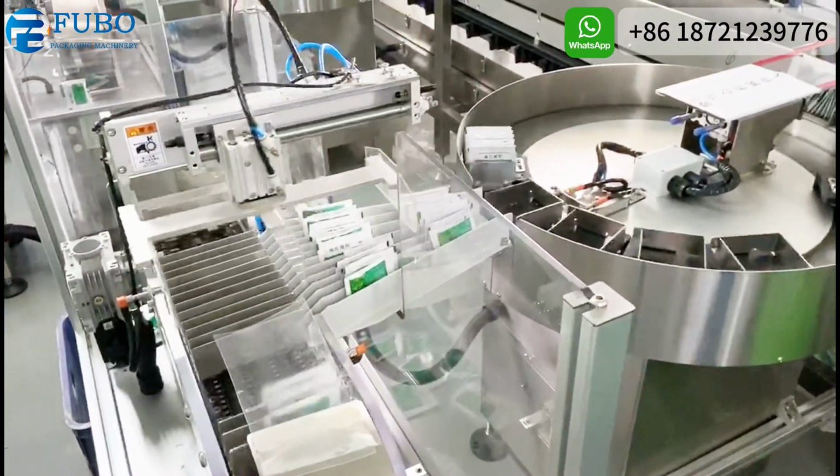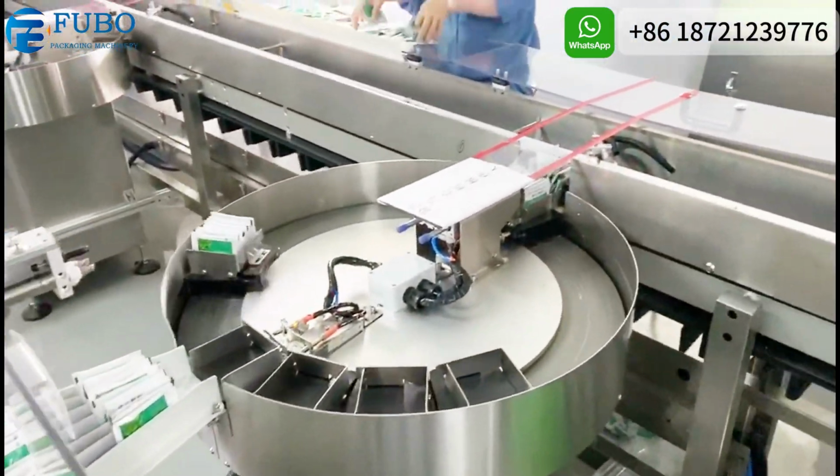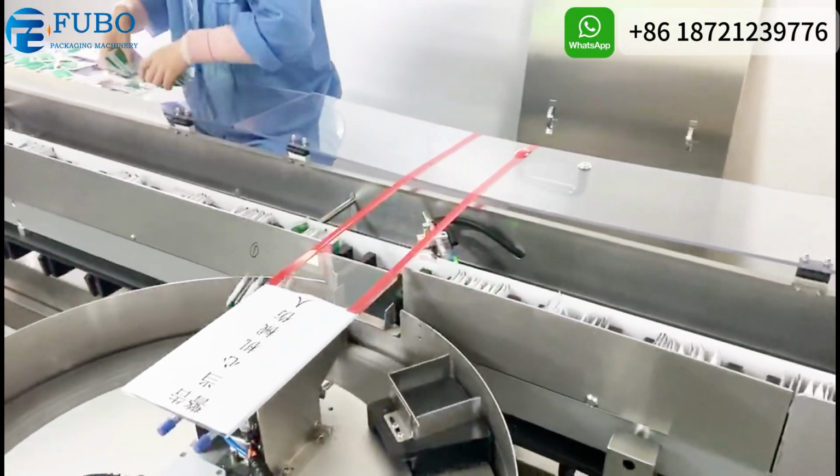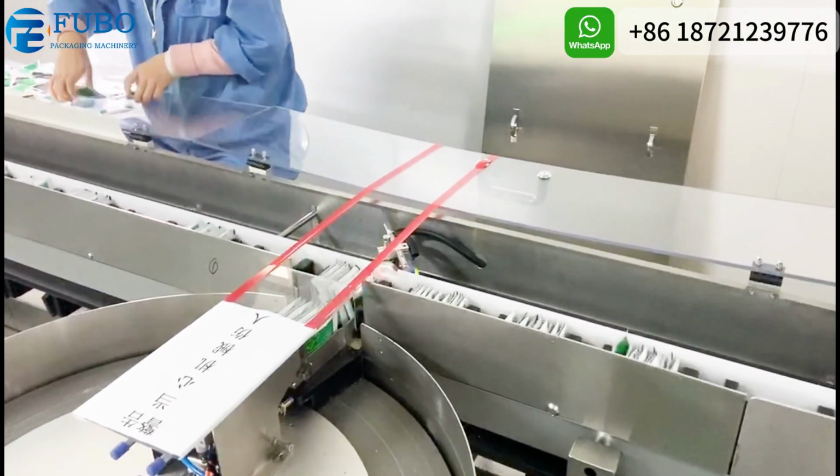2. Counting, accurate counting. The machine counts the sachets as they are sorted, providing a precise quantity for packaging or other processes.